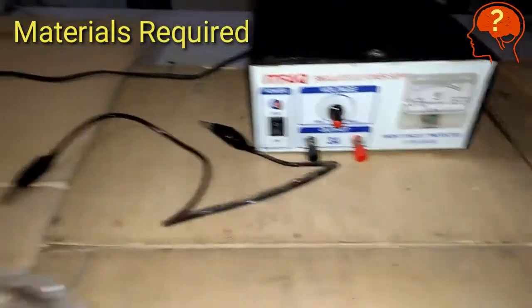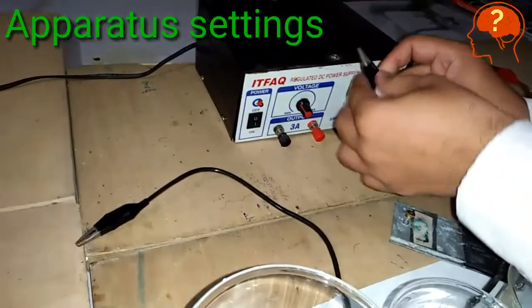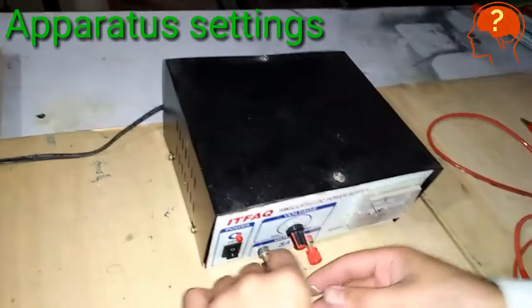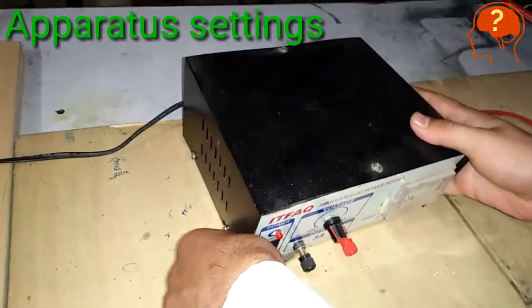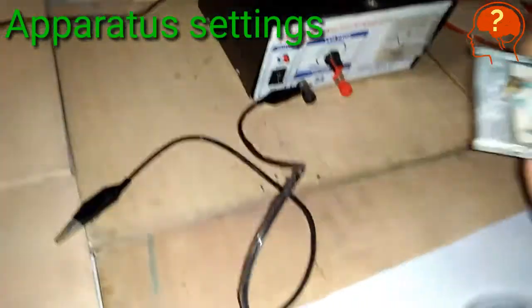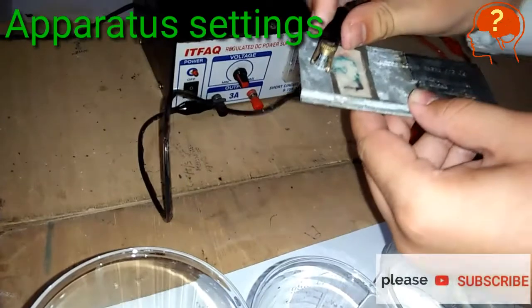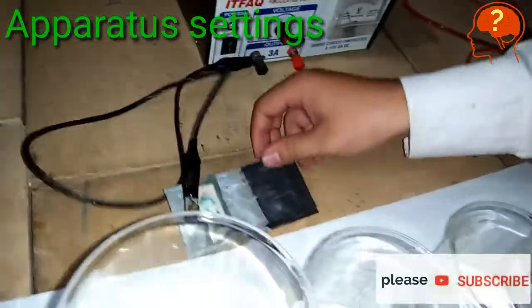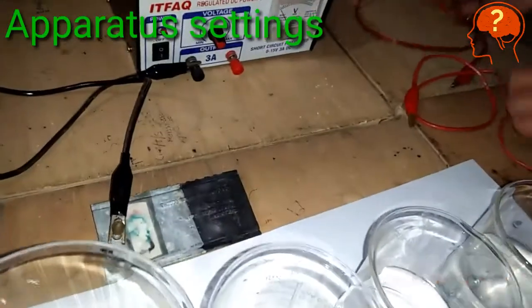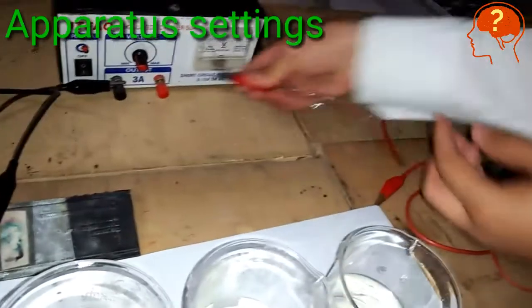Another wire which is black in color. For the operator setting: connect one terminal of the black colored wire with the terminal of the battery that is black in color, and the other end of that wire with the zinc electrode. Be careful while connecting the wires and switch off the battery before all this process.